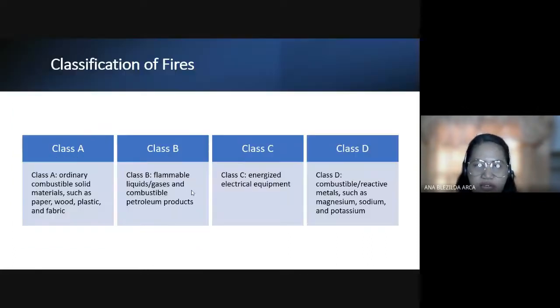Okay? So, anong kailangan mong gagawin dyan? First, you must be able to classify ano ba yung type of fire. Bakit kailangan pa nating alamin? Mayroon pala mga class ang fires, 'di ba? Sunog 'yan eh. Kapag may sunog, 'di ba, ang gagawin natin, tatakbo tayo, 'di ba? 'Yun ang unang reaction mo eh. Aalamin mo pa ba kung class A 'yan or class B fire, 'di ba? Actually class, kapag may sunog, as much as possible talaga, if you can defend yourself at meron kang dadaanan, tumakbo ka na lang, 'di ba? May dadaanan ka naman, edi takbo ka na. Wag hayaan mo na yung mga yan, yung apoy na yan, 'di ba?